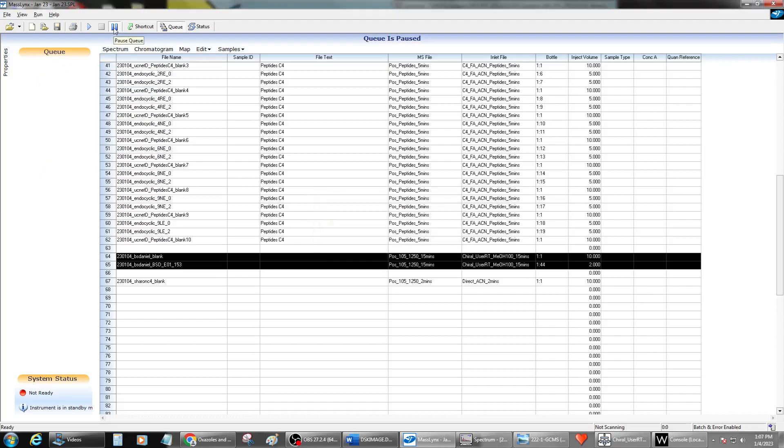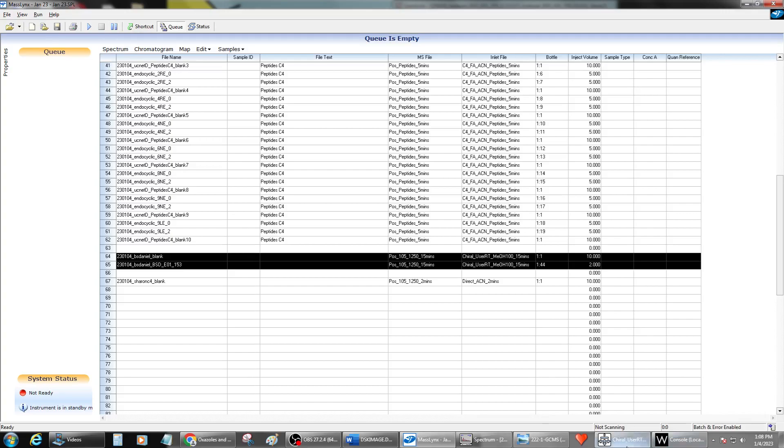And so I'm going to go over and just first I'm going to go to the queue and I'm going to delete the wrong information in the queue here. So I'm going to delete the queue. And then I will go ahead and unpause. Remember that pausing and unpausing is different from playing.